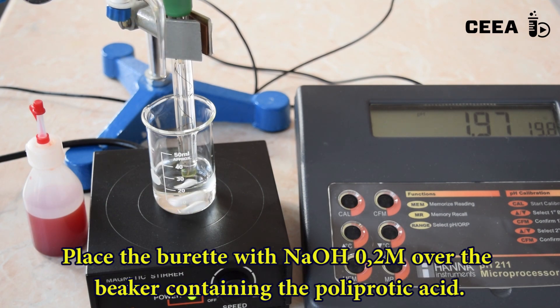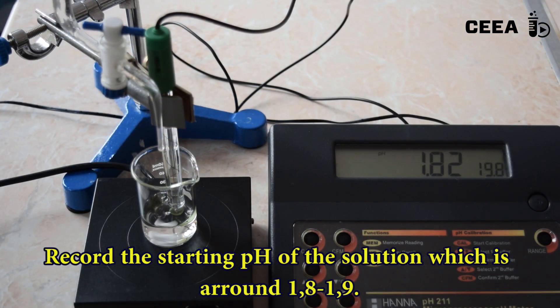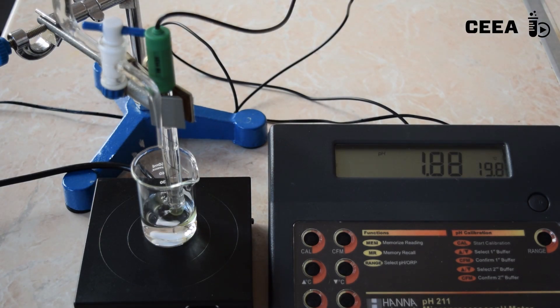Add the 0.2 molar solution of sodium hydroxide. Record the initial pH of the solution. Start the titration and record the pH at each 0.5 milliliter of base added.